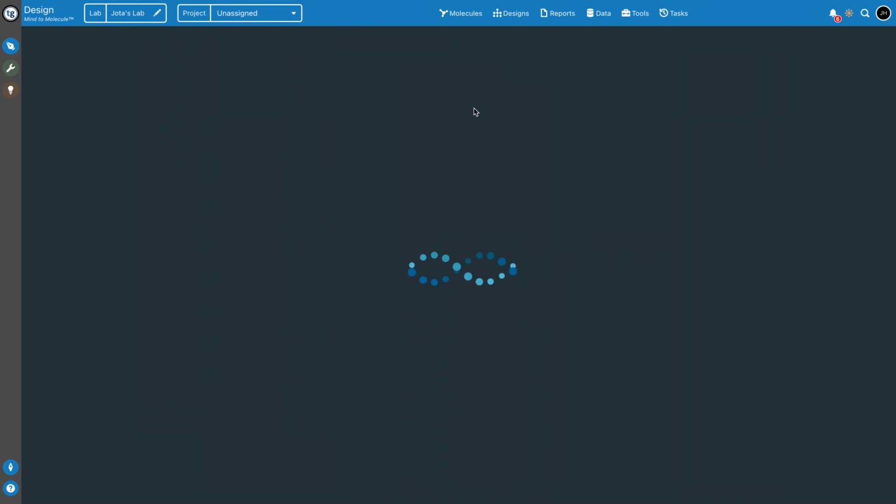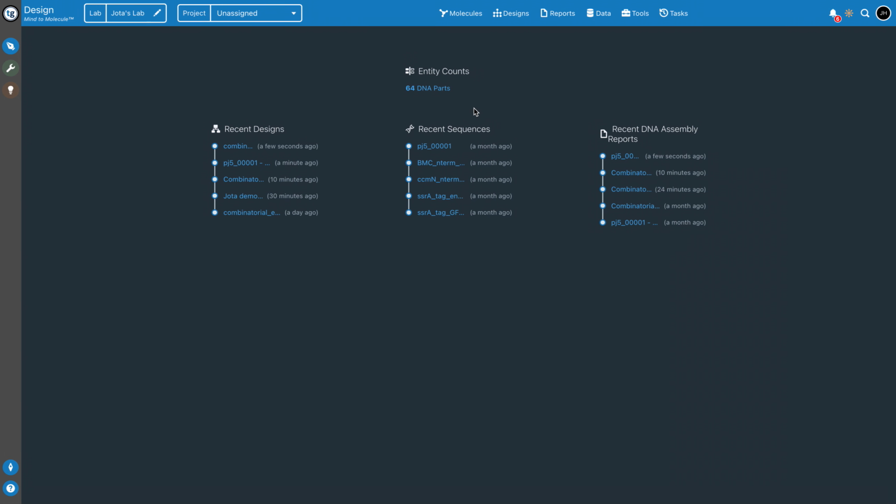So thank you very much for looking into this. This is a quick and general overview of the design module. There's more things that you can do and go deeper, and things that you can tweak, but I just wanted to show you a quick, simple overview and how a workflow will look like, and how you can use this to really make the work in the lab way easier, automating a bunch of manual things that you need to calculate.